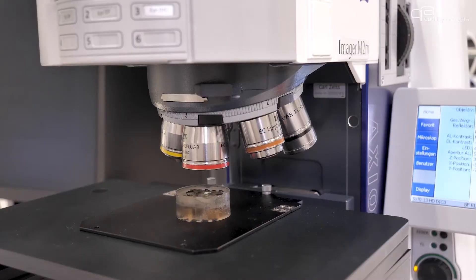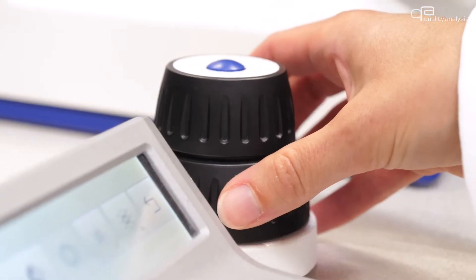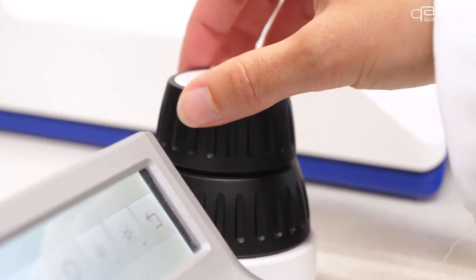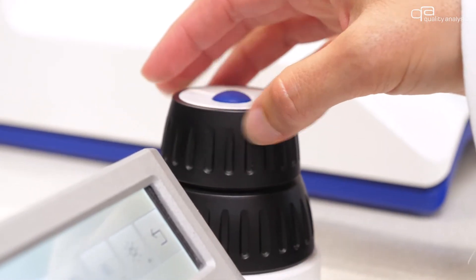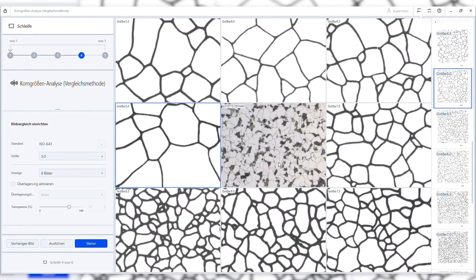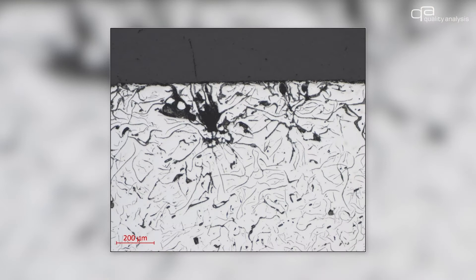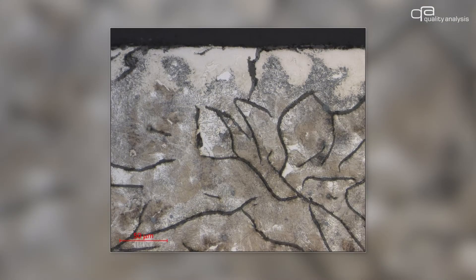Our material microscopy systems feature comprehensive modules. These include the determination of grain sizes, phases and layer thicknesses, the classification of graphite particles, and the evaluation of non-metallic inclusions.